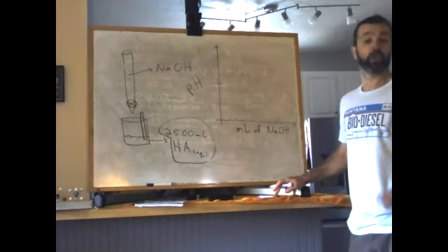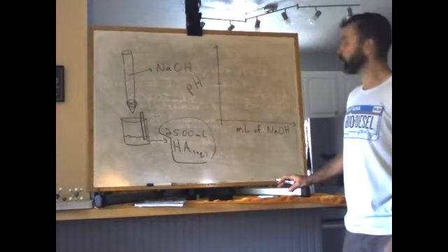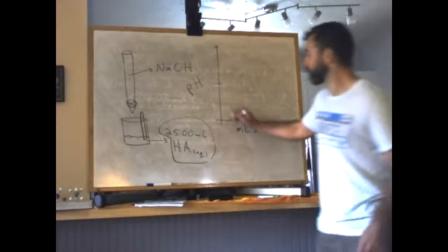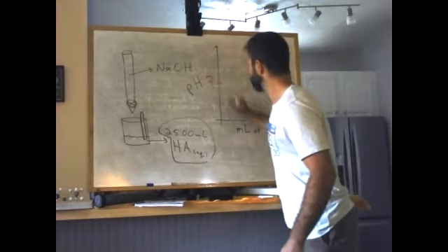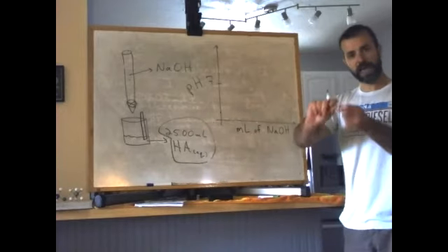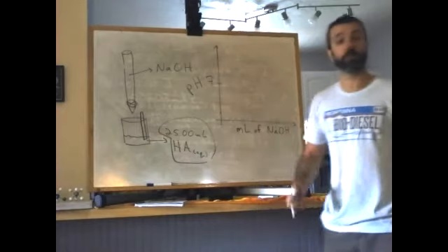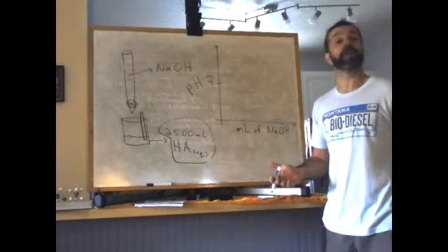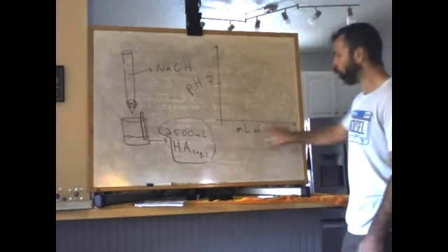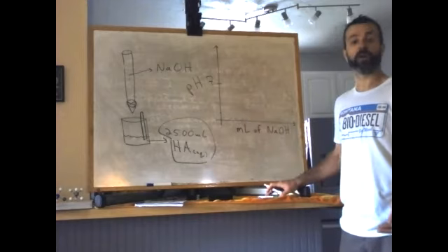In lecture, you could calculate what that pH would be if you knew what the weak acid was. What we're simply going to do in this lab is measure the pH. But suffice it to say, it's an acid, so the pH should be below 7. Should be low. And as we add NaOH to this, as we open this stopcock and let NaOH go in, the pH better be going up because we're adding a strong base. And the pH goes up as we add NaOH the whole way through this reaction. But exactly how the pH changes is important to understand.